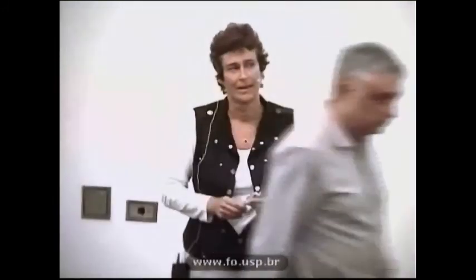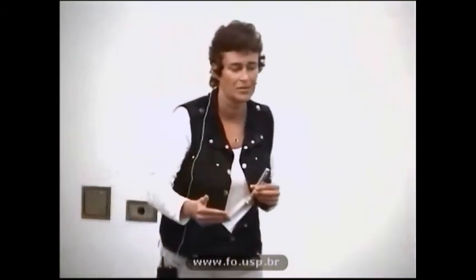Okay. Now, the accelerated aging, I must admit, there are warning signs. Watch out. We don't know what's going on with time. We are currently working with Chevalier, doing focused ion beam slices through accelerated-aged zirconia ceramic, and we can prove that the degradation goes down 8, 10 micrometers with accelerated aging equivalent to 20 years, whatever that is.